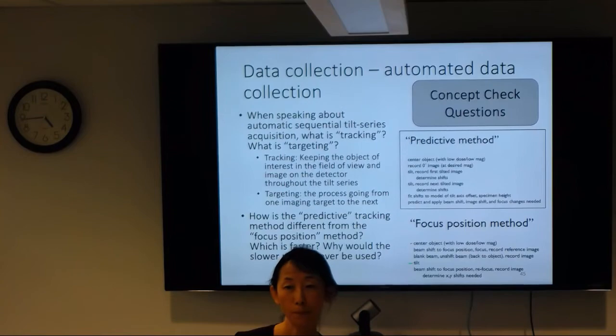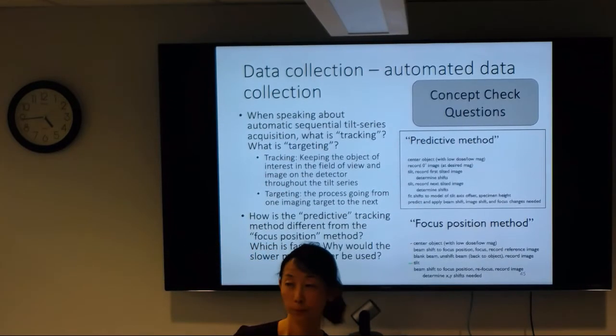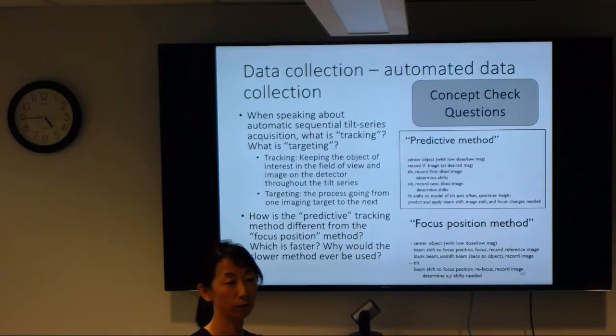Isn't that what is put in the metronome? Yeah, the metronome will have at least one focus position method. Yeah, I thought it was a little hybrid now. I thought it also does a lot of modeling and prediction too. Yeah, it's hybrid. Many of the programs are a combination of the two, especially for the focus position. If you do predictive, you can do predictive alone.